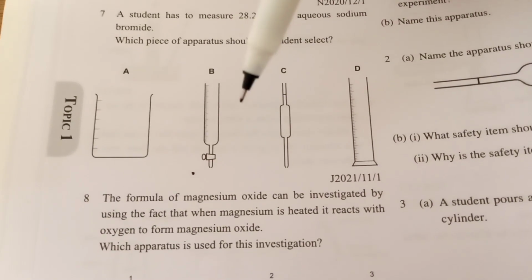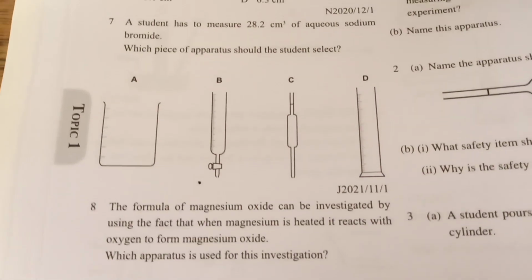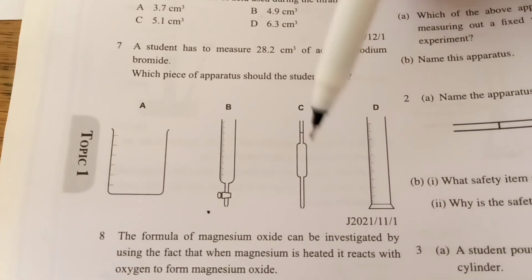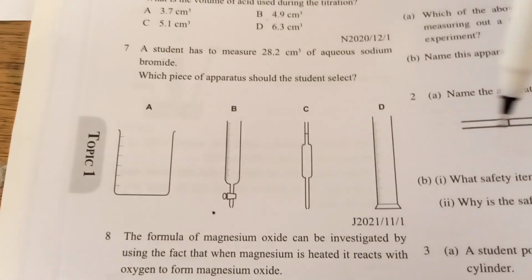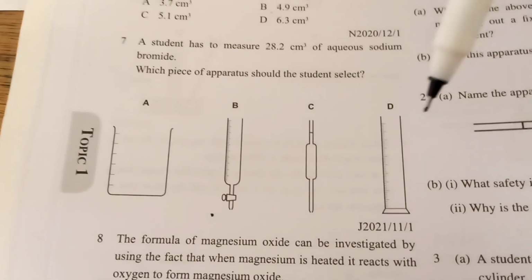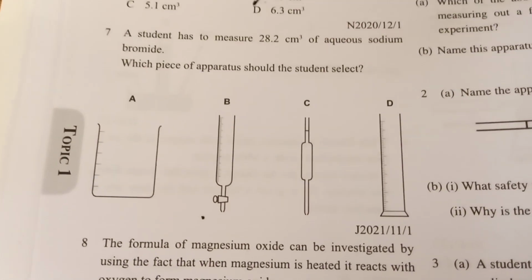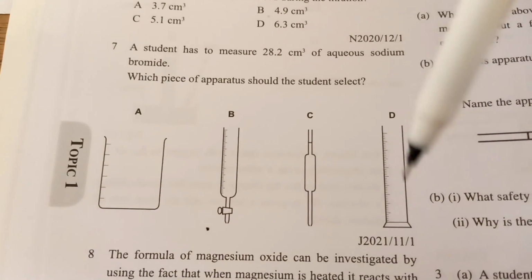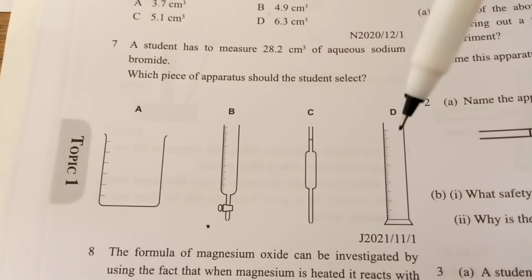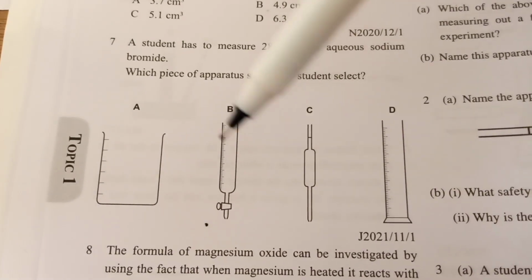This we can use because it is precise, a burette. This we cannot use for decimal places, only 25 cm³ or 10 cm³, depending on the size of the pipette. This is a measuring cylinder. We can measure 28.2 sodium bromide, but it is not precise. So we prefer to use a burette.